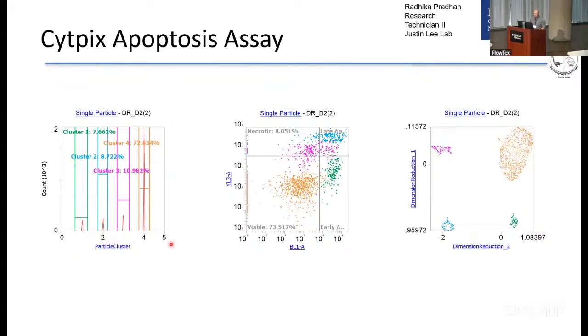It divides the data into either user-defined clusters or automatic clusters, and also lets you create a UMAP. Based on the high dimensional analysis, it divides up really distinctly, and these clusters of cells overlay really nicely with the traditional analysis. So far, so good.